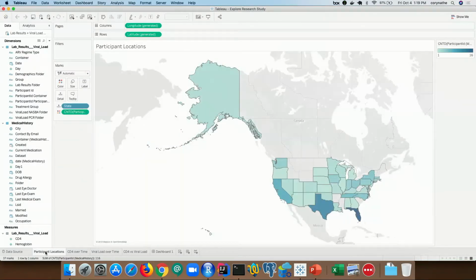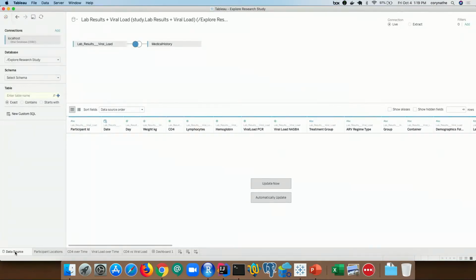And Tableau also has many different other charting visualization options, a demographic participant location type of chart here as an example. But to kind of work backwards again, so to show the data source tab here in Tableau, as Xing mentioned on the slide, and this is very similar for the other types of tools that connect to LabKey with the ODBC driver. It's usually about, once that connection is made, you're shown what would be the virtual schema in LabKey. So not the true database schema tables at the lowest level in LabKey, but the virtual tables, because of kind of like that permissions model as we talked about.